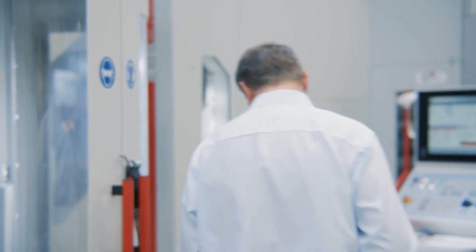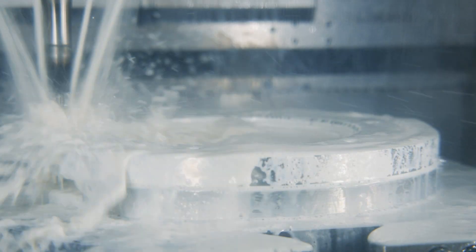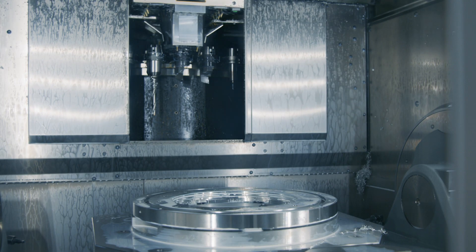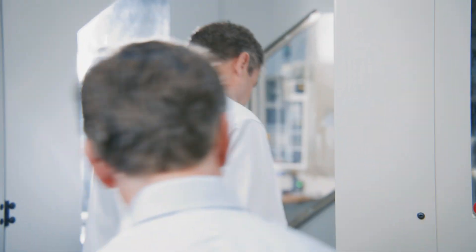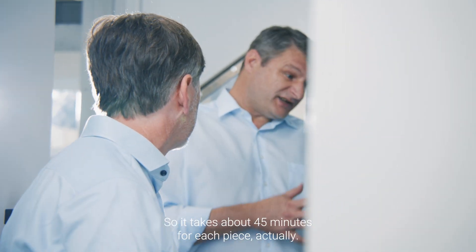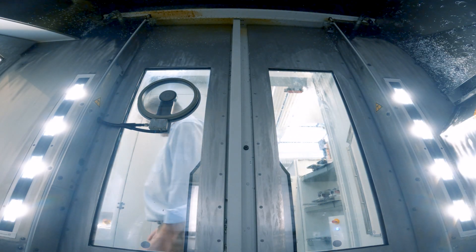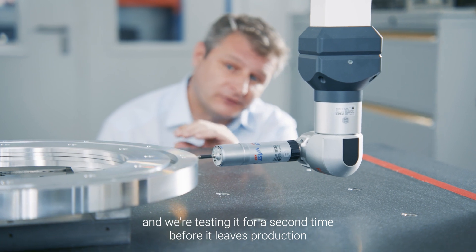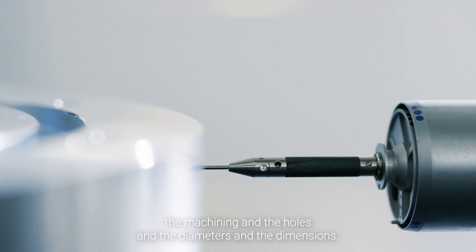So if we go take a look... I think it's just finished now so we can go and take a closer look. How long does it take to make this part? It takes about 45 minutes for each piece. What we're looking at here is the groove ring again, and we're testing it for a second time before it leaves production to verify the precision and accuracy of all of the machining — the holes, diameters, and dimensions.